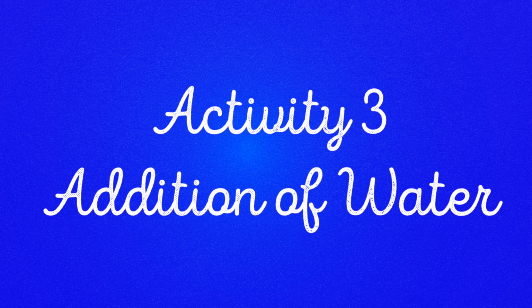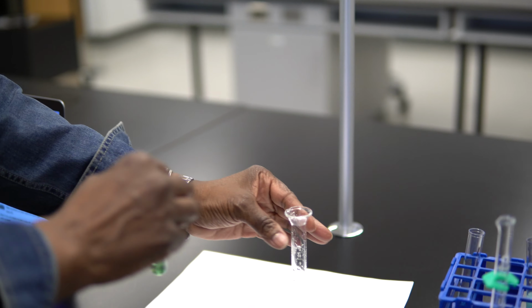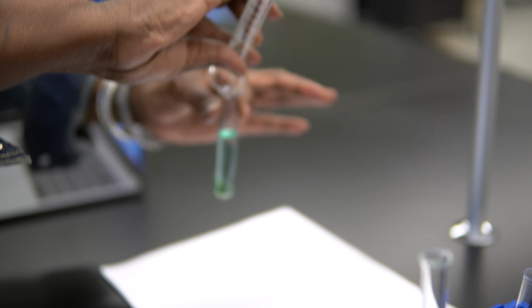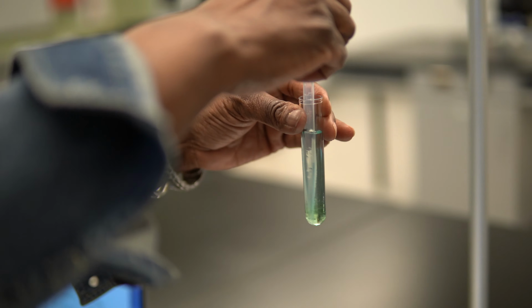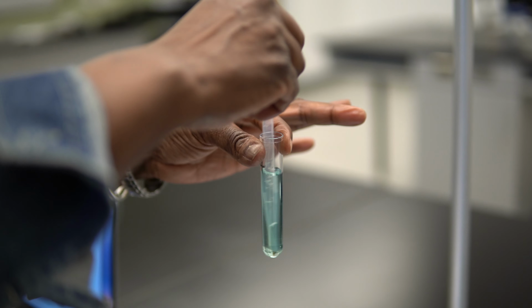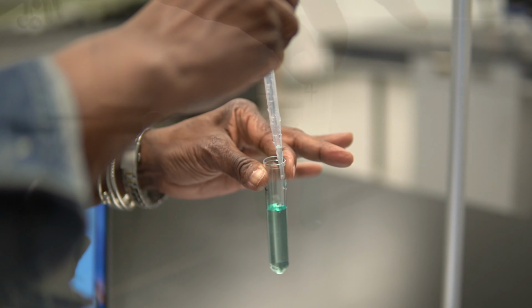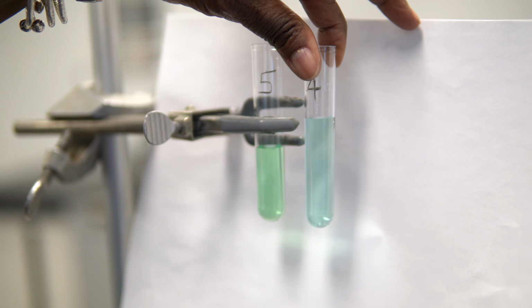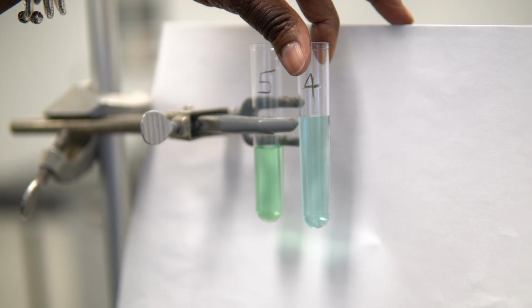Activity 3, addition of water. Add 3 milliliters of water to test tube number 4 and stir with a pipette. Compare the color of the solution in test tube number 4 to the color of the solution in test tube number 5.